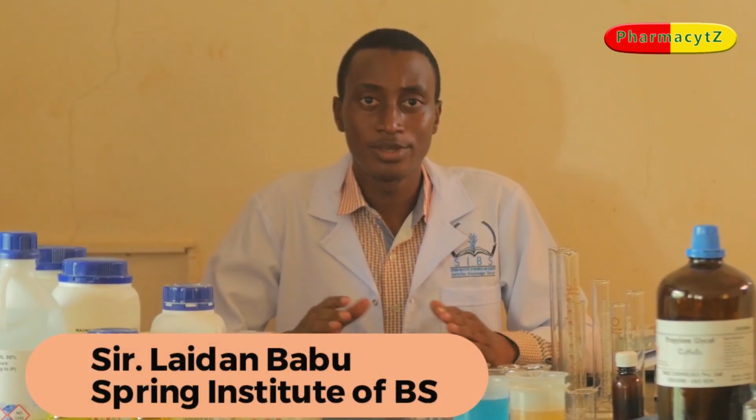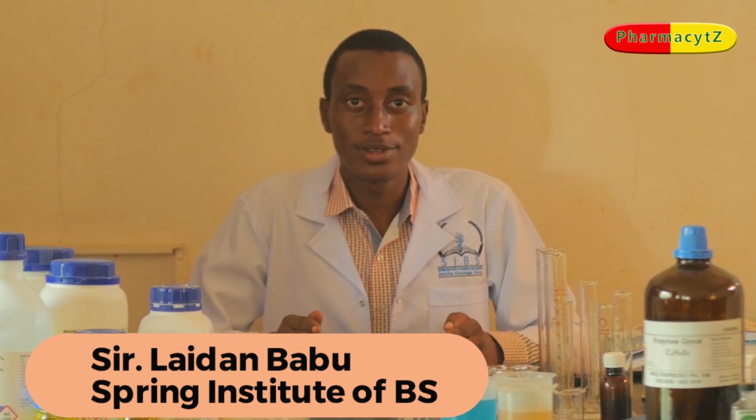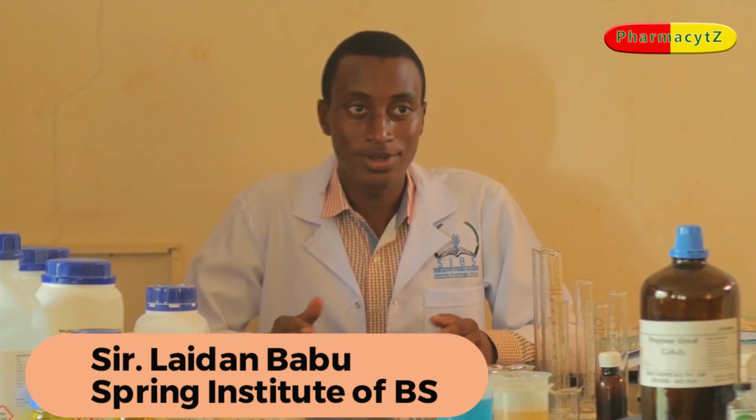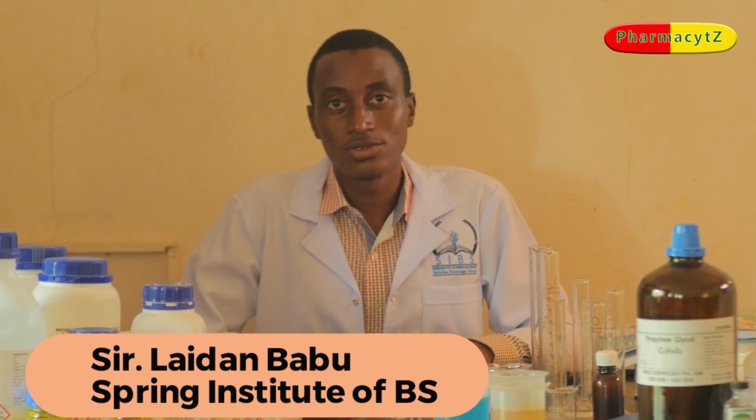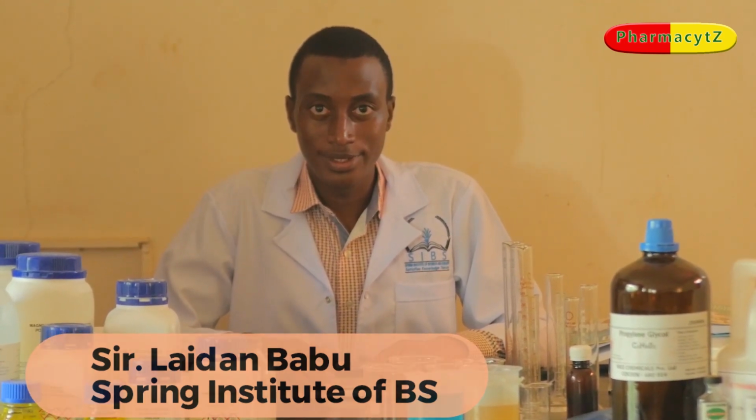Okay, it's Mr. Laidan. Today we are going to demonstrate how to make iodine solution. In fact, when you go through different reference materials, you find different preparations of iodine, especially aqueous iodine solution, which is also known as Lugol's solution. And you'll also come across weak iodine solution and iodine paint. So today we are going to demonstrate how to make aqueous iodine solution.